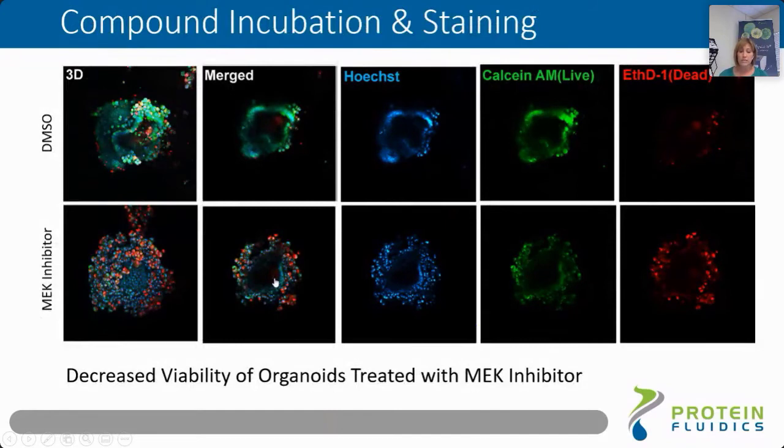Now, using this established gastric organoid model, they examined how cellular behavior changes by inhibition of KRAS signaling. And in this study, organoids were treated with a MEK inhibitor, which is a downstream mediator of KRAS signaling. And here, first, I will show you these beautiful images.